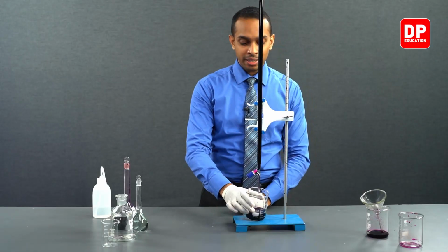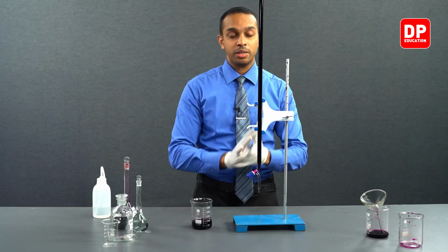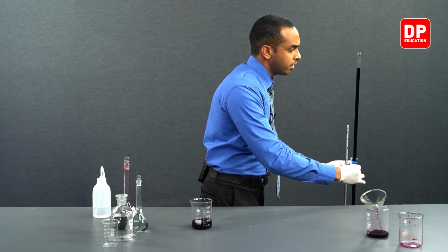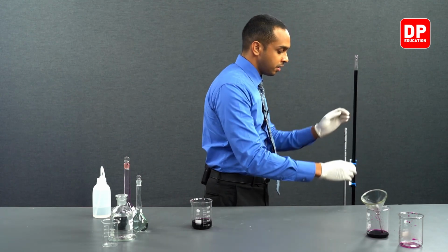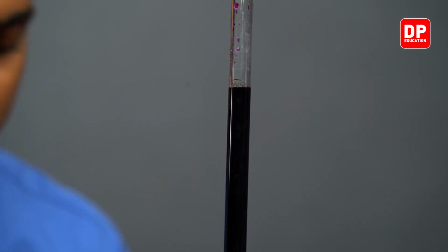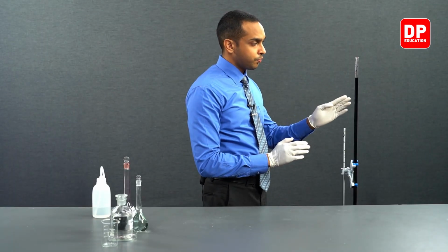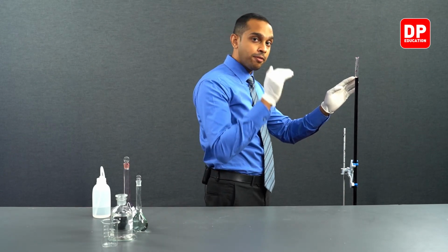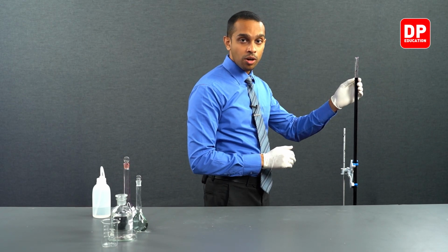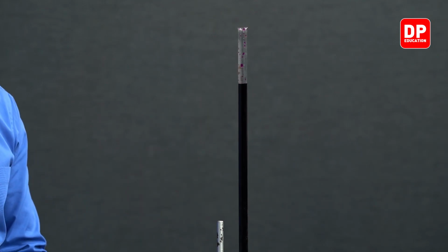Now I wanted to show that to you. That is why I brought the burette onto the table again. Now we have to make sure we keep it at eye level and bring the solution down onto the zero line. So let's do this together. In this burette, we have the solution level above the zero line, and we have to make sure that the meniscus of the solution over here aligns with the zero line of the burette.